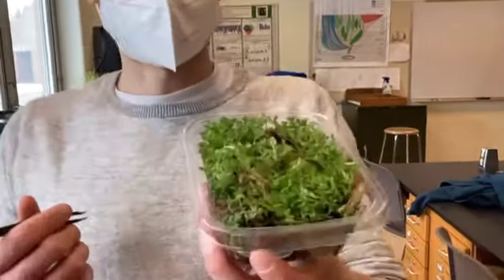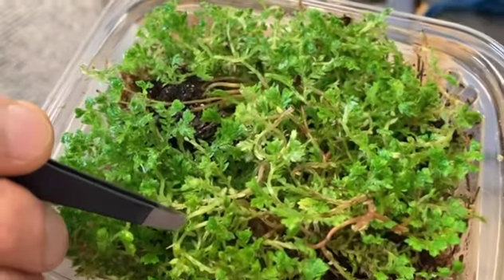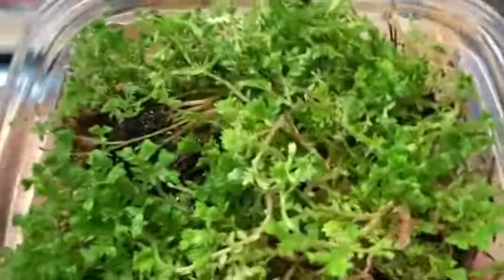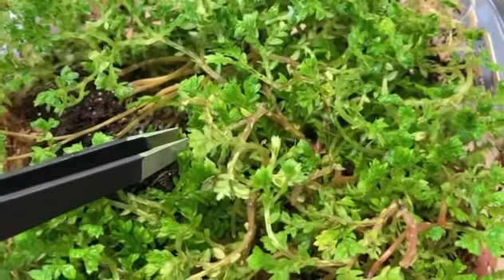So let's take a look at this up close, because you're looking for those defining features of a microphyll. So hopefully you have a chance to handle this in person, but in order to see these, you should really be looking for those tiny individual leaves.